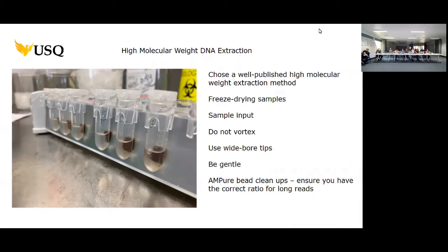Don't vortex. Vortexing shears up your DNA. Don't do it. The last stage that I vortex is when I lyse the sample. That's fine, make sure it's lysed properly. After that, don't vortex. Don't pipette mix either. That will shear your DNA. You need to do mixing really gently, and it does add time and it takes a bit of time to get through, but mixing it really gently is going to be really effective.